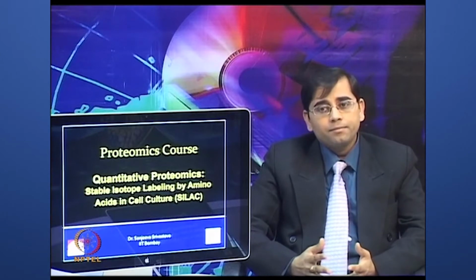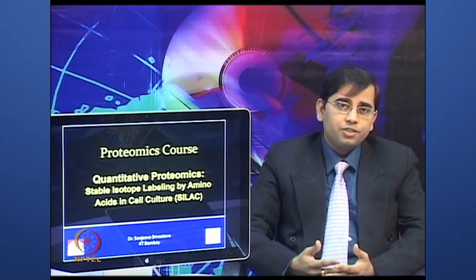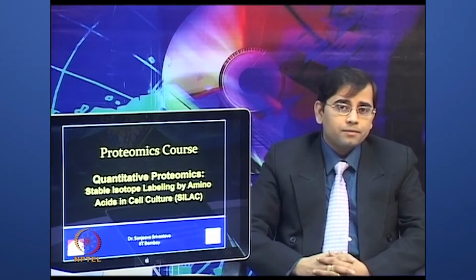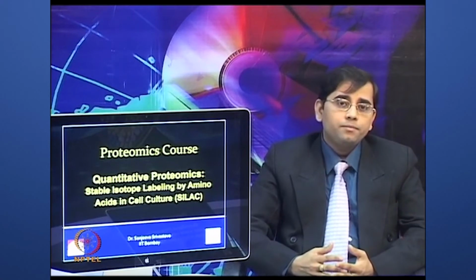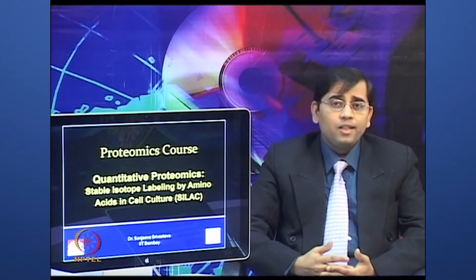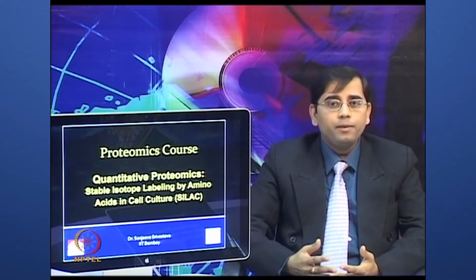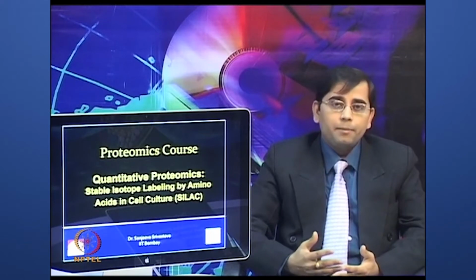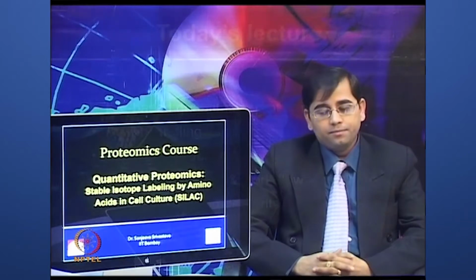Advancements in MS include the development of highly sensitive mass spectrometers, fast scan rates, automation, nanoflow liquid chromatography, as well as new techniques and methods to quantify proteins and their abundance for quantitative proteomic analysis.